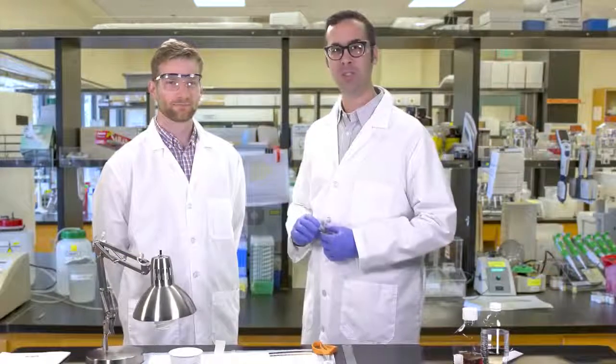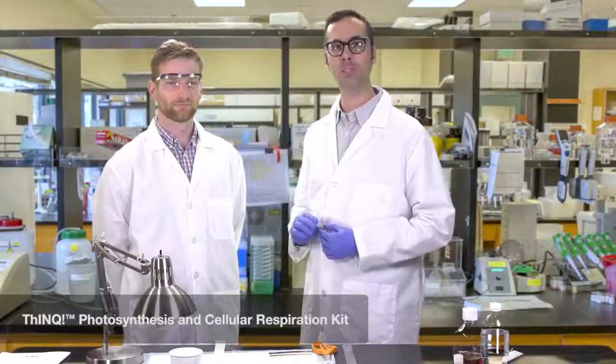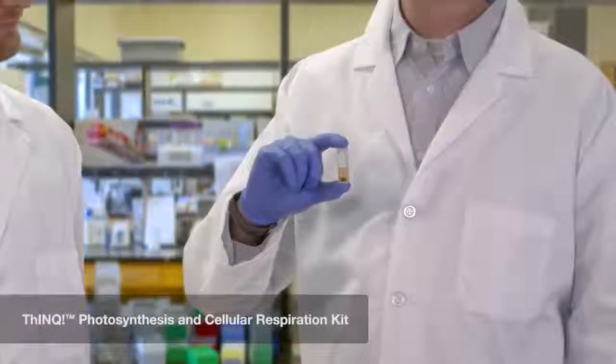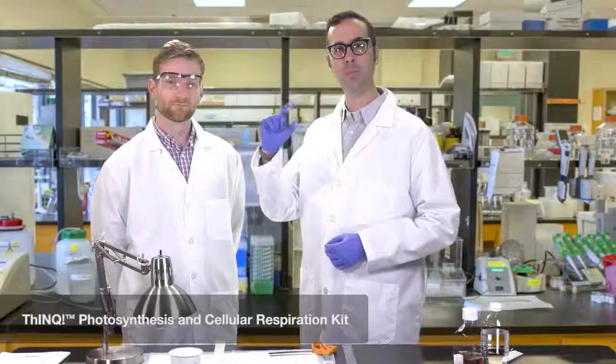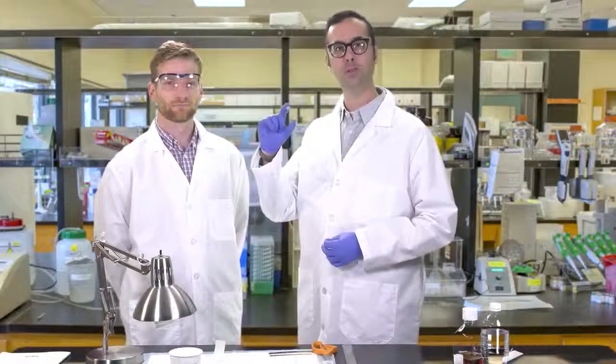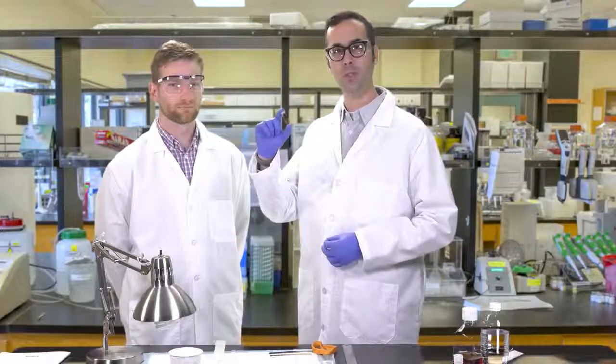Biorad's Photosynthesis and Cellular Respiration Lab will help you explore these important life processes. The kit uses algae beads and a color-changing solution that responds to the amount of carbon dioxide consumed or produced by the algae during photosynthesis and cellular respiration.